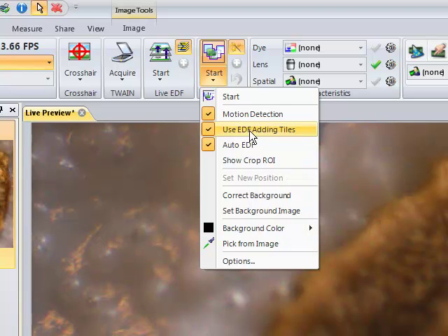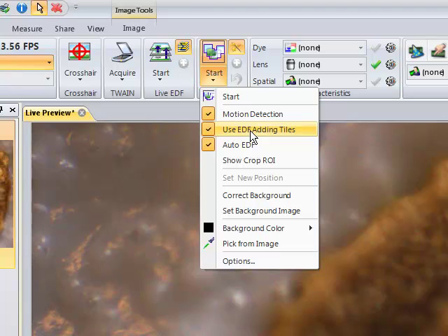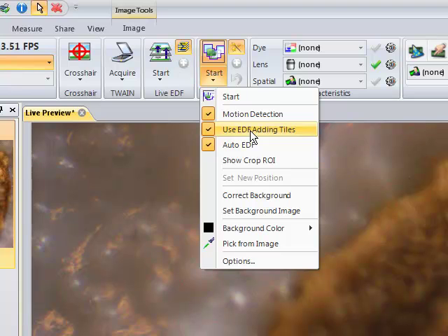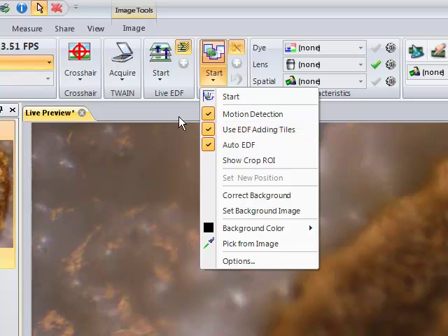Next is we want to add EDFs during the tiling, that's the next check box, and then the tiling is auto EDF. That means it'll just simply start stacking together, producing the EDF image on the fly as I do the focusing.